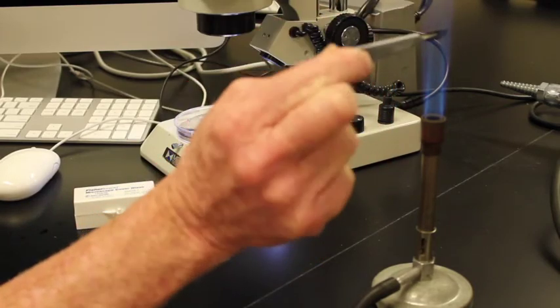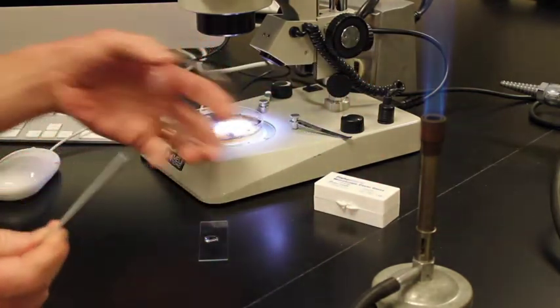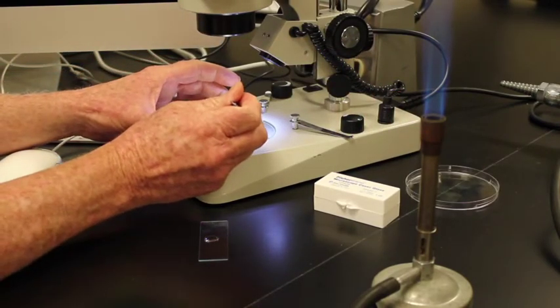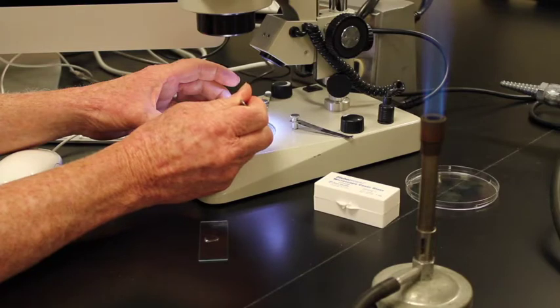Now the nice thing about dissecting scopes is that I can use the dissecting scope to watch and see exactly what's going on in here. Okay, so I'm going to use this dissecting scope.